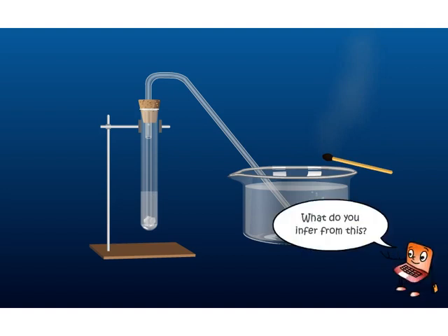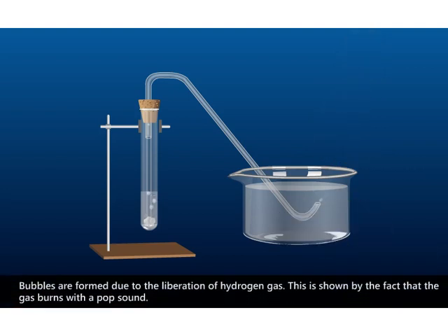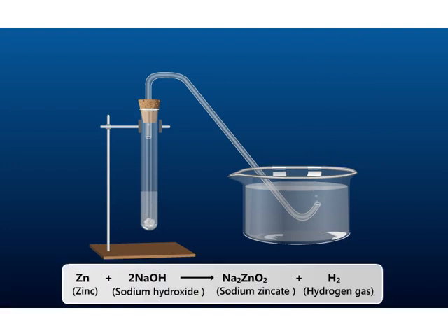What do you infer from this? Bubbles are formed due to the liberation of hydrogen gas. This is shown by the fact that the gas burns with a pop sound. Let us represent this in a chemical equation. Sodium zincate is formed and hydrogen gas is liberated.